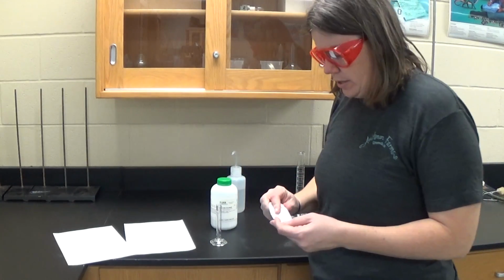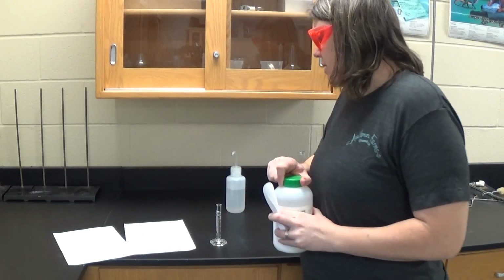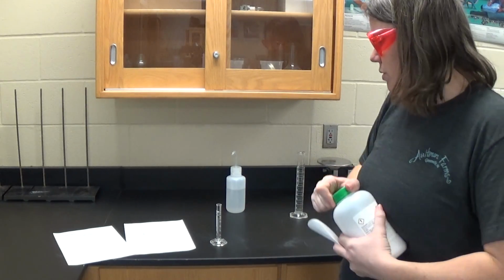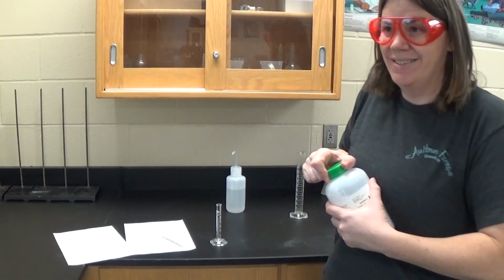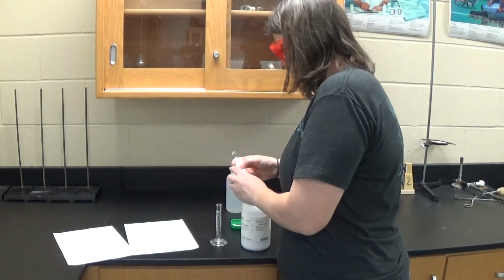So let's start with folding our spoons, and it says to place 2 small scoops of calcium chloride into our graduated cylinder. I have a lid that's being grumpy here. Alright.